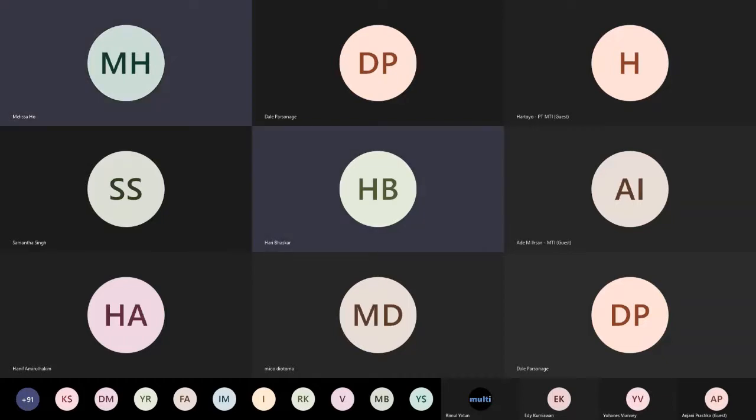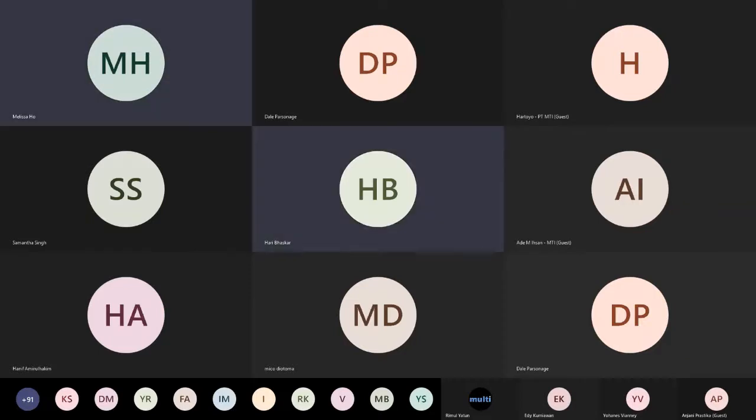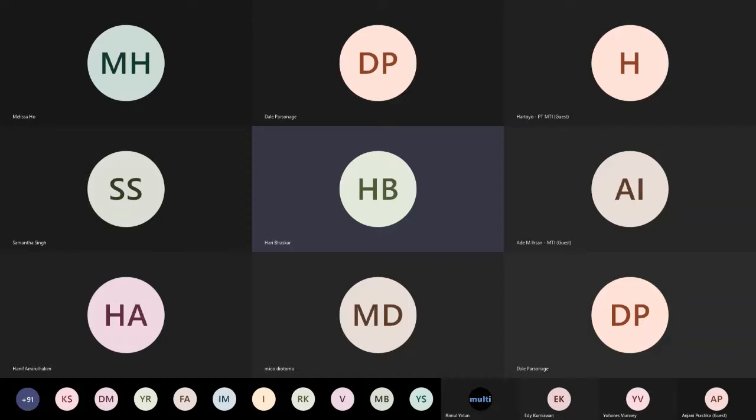All right. Let's see if we have time for one last question. Is there an easy way to calibrate the Epsilon 4? Okay, yeah, the Epsilon 4 in general is quite simple and easy to calibrate.